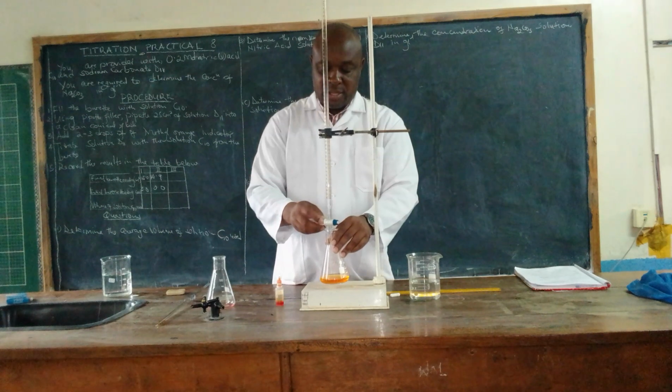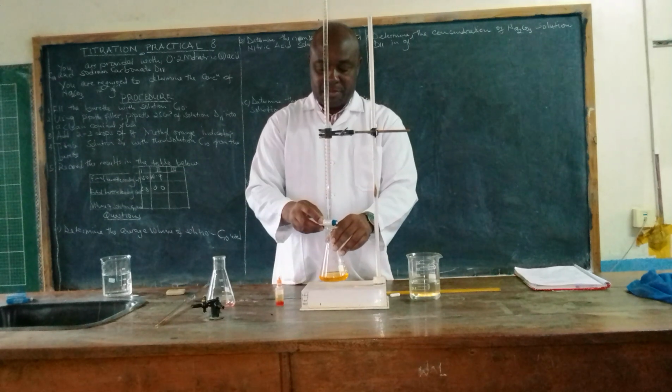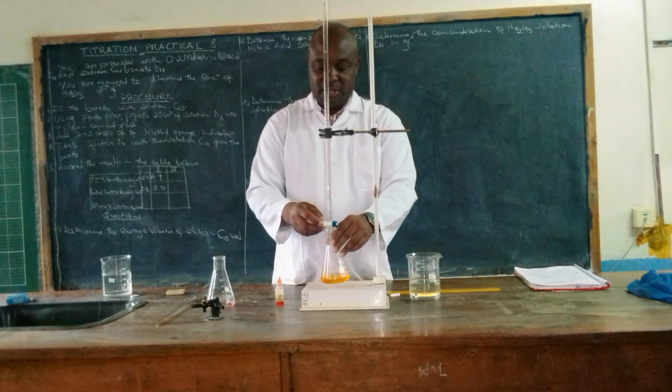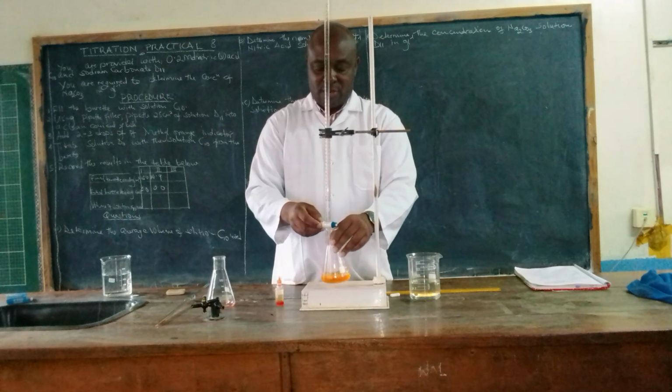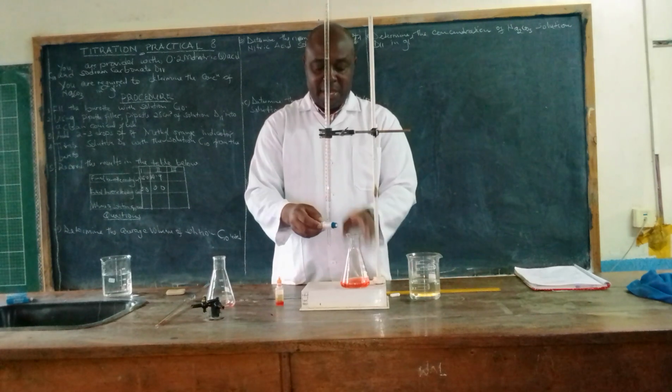As you shake like that, like that. Our expected color change is supposed to be pink, as you have been seeing in the first 2 titrations. Wow, the color has changed. Almost. Wow, the color has changed to pink.